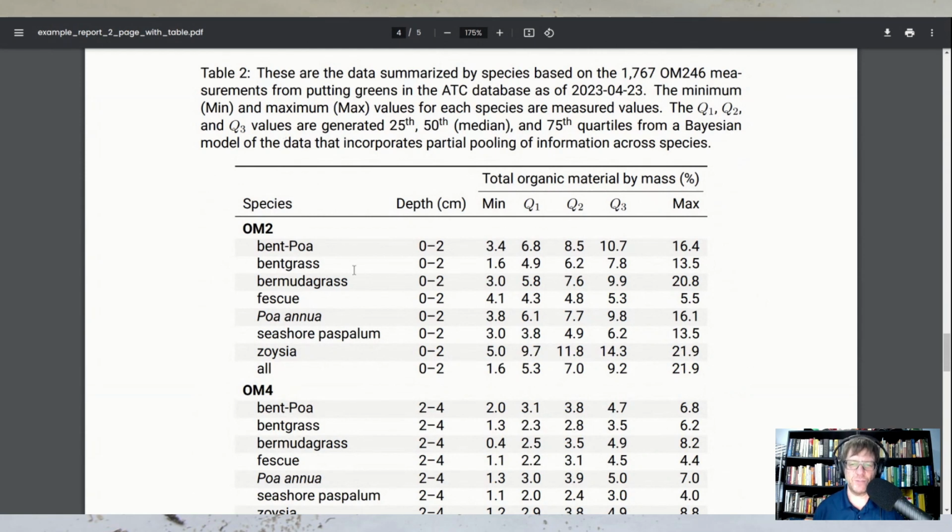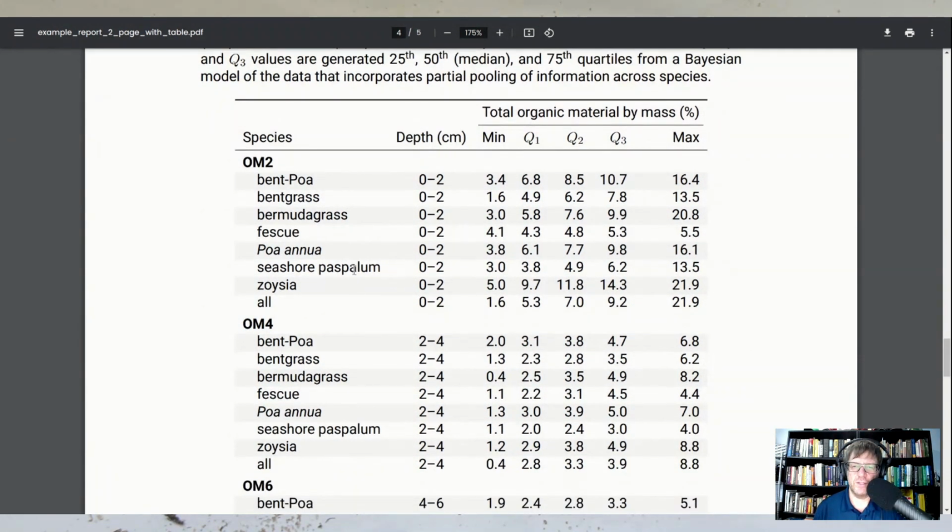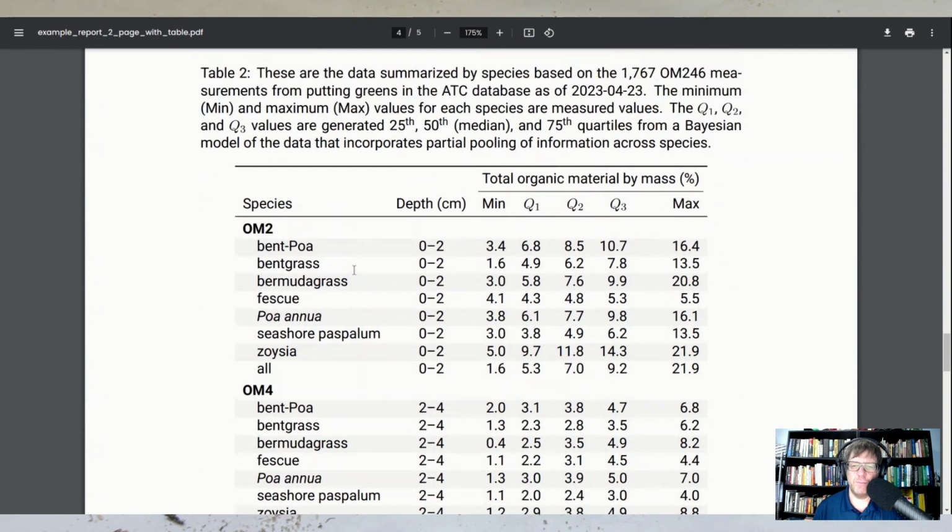And I want to point out something that is, well, I don't know. Maybe it will be interesting to you. It's interesting to me because I think that this is quite accurate. It's using the power of statistics and data analysis and statistical models to use the data from the entire data set to provide even more information about the samples from any particular testing event.